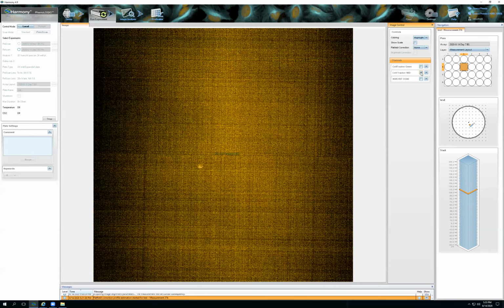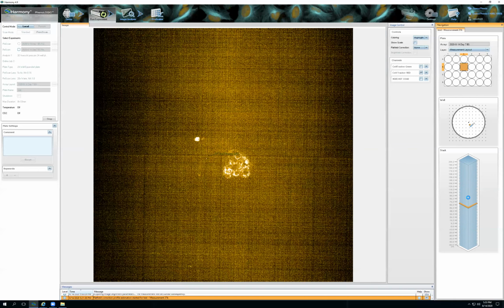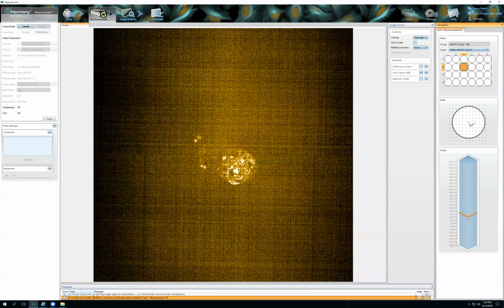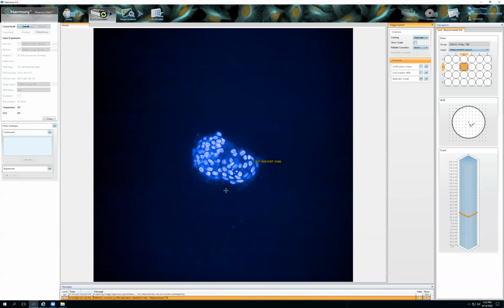So now I'm going to go to my next channel, which is my red channel. Again, go roughly. You can go down each slice. You can see that this is absolute garbage and the intensity is way too low. So this needs to be increased a lot. And then next, let's go to our Hoechst channel. And this one looks pretty nice. My Hoechst staining is generally more intense. So you can see that the background intensity is between 100 and 200.